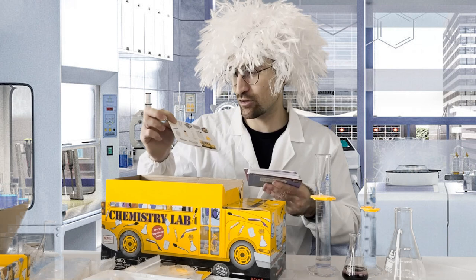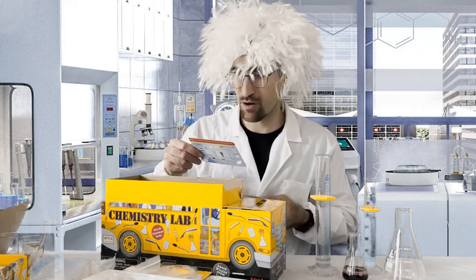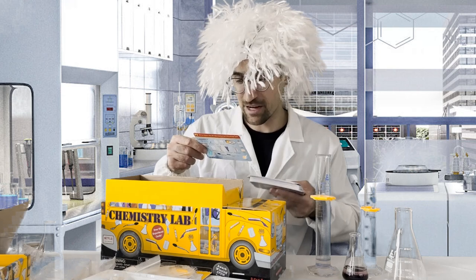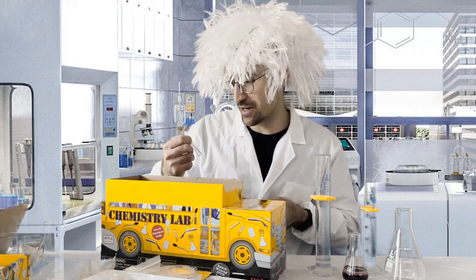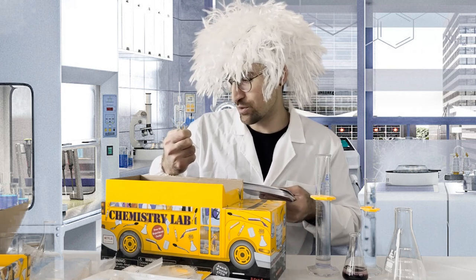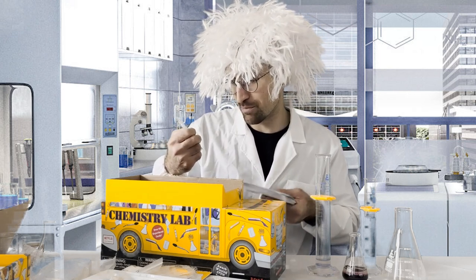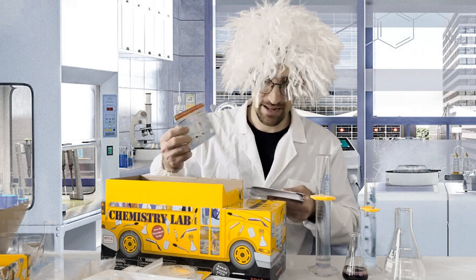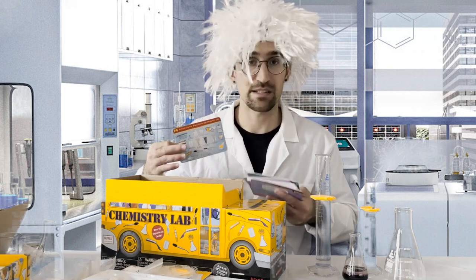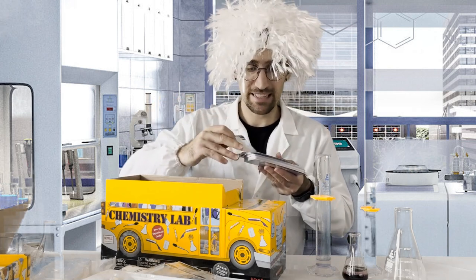There's a lot that's included in this kit and it's all listed here: the data notebook, foil, experiment cards, iron, chromatography paper, test tubes, funnel, liquid dish soap, piece of cardboard, clay, a large petri dish, the bus container itself, borax, goggles, glue, soap, red/blue and litmus paper, pH paper, measuring cup, string, a pH chart, ruler, popsicle sticks, a straw, balloon, pipette, and test tube. Really a lot of value — it's very comprehensive.